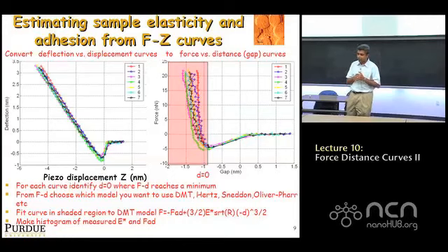And that has to do fundamentally with the fact that, in contact mechanics, the area of contact actually evolves. It's not like putting two flat plates and pressing them together. The amount of area of contact changes because it's sphere-plane contact, and that's why you get this 3/2 power law, even though the underlying constitutive properties of the elastic material are linear, but the geometry of contact introduces a nonlinearity in the process. Okay?